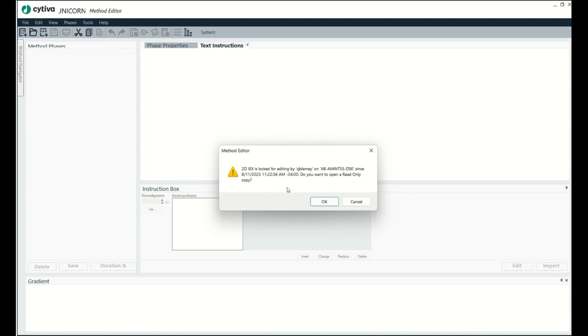So that's what I wanted to show you how to fix today, how you unlock this file. So let's go unlock it right now. I'm not going to open it as read-only.